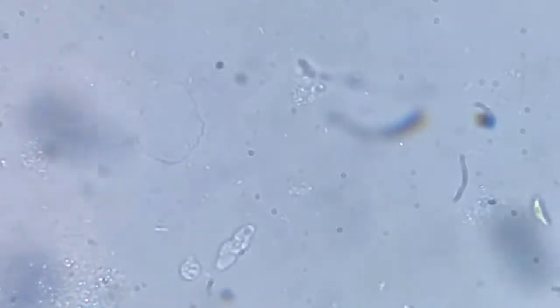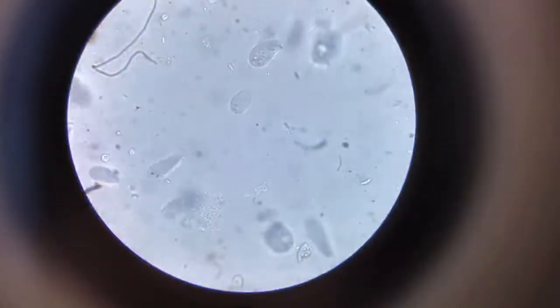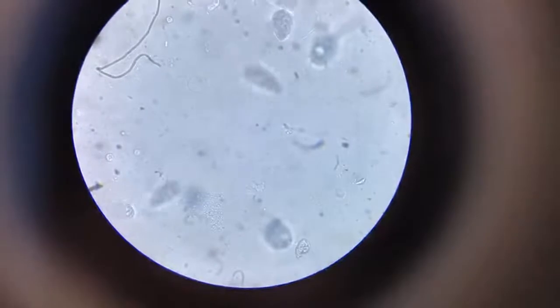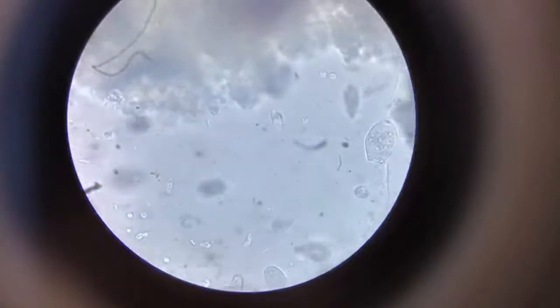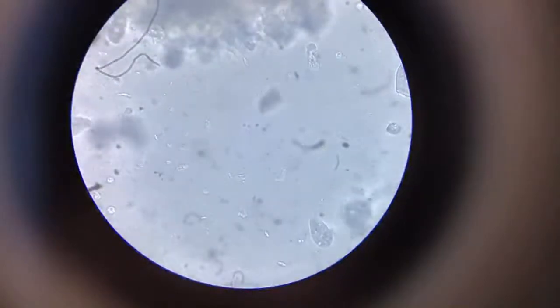Okay, so we go to some other part now. I think we just scan some other part of the slide and see if we can find something interesting. And in another 5-10 minutes, we'll stop this. There are some more amoeba, as we were expecting. They are all coming out. You see them there? Let me zoom it for you.